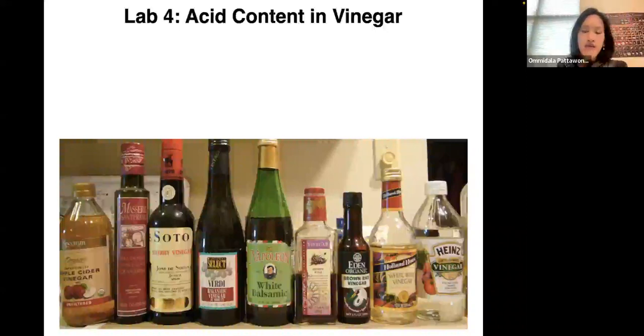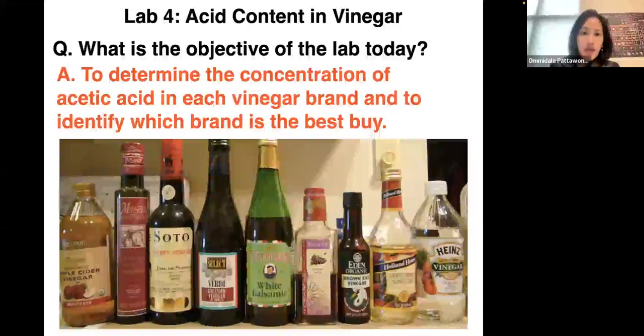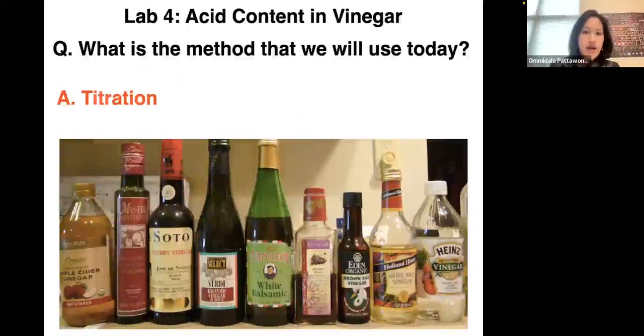Hi everyone, in this pre-lab video, I'm going to go over a brief theory of titration and also the pre-lab question for this week. What we are going to do in lab this week is determine the concentration of acetic acid in vinegar, and then find out which one is the best buy. The method that we're going to use is titration.